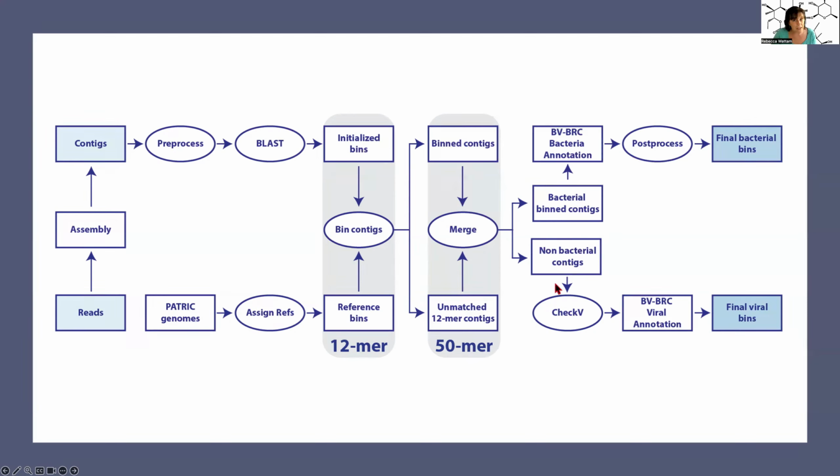If they're non-bacterial, and this doesn't mean fungal or apicomplexan or other pathogens, it means viral, okay? We don't handle those other things. Those go through CheckV to try to determine what they are, and then the BV-BRC annotation service, and then you have the final viral bins.